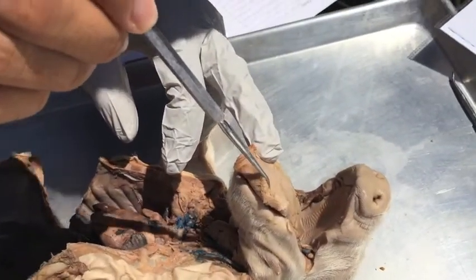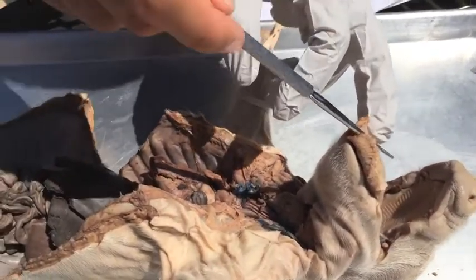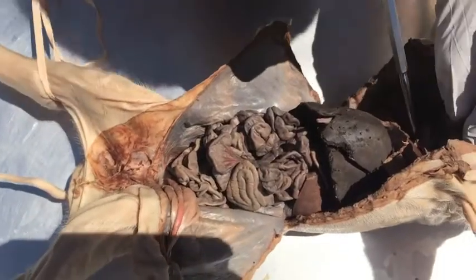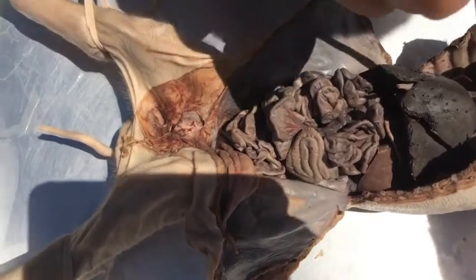And then right here is the tongue, and the tongue is covered with taste buds, which allows the pig to taste and also helps the pig articulate words or sounds. The aorta is gonna be right here, right? And it's gonna supply systemic circulation to the entire body. The entire body basically gets the blood from there.